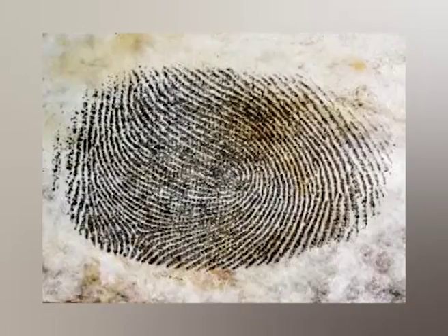So, let us start our lecture with the introduction to silver nitrate and iodine fuming technique. First of all, we will be explaining about the silver nitrate technique. Silver nitrate technique is one of the oldest methods of detecting latent fingerprints on porous items like paper, cardboard and wood. The method is based on the reaction of silver ions with the chloride content of sweat residue.